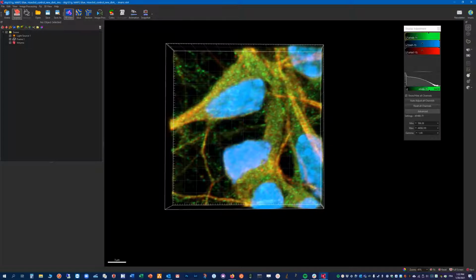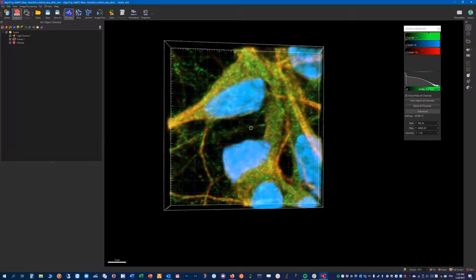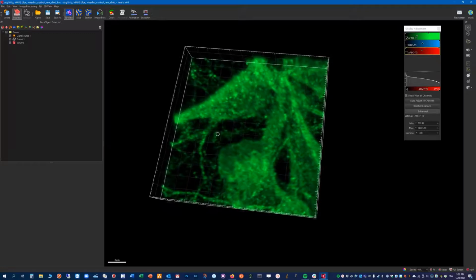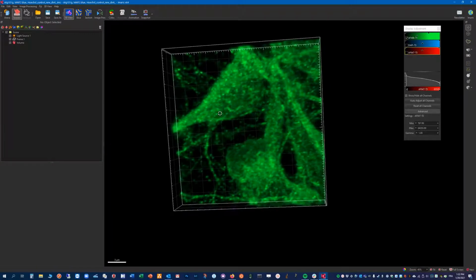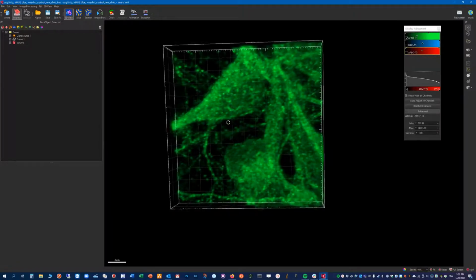Okay, so in this video I will show you two different ways to define your surfaces manually and semi-manually. When you have such a data set, it can be quite complex to let the program decide automatically where the signal belongs to what cell.